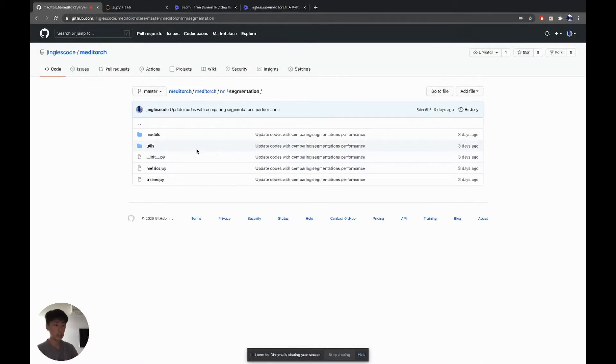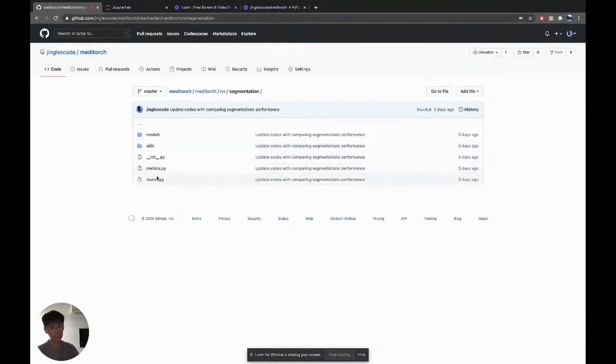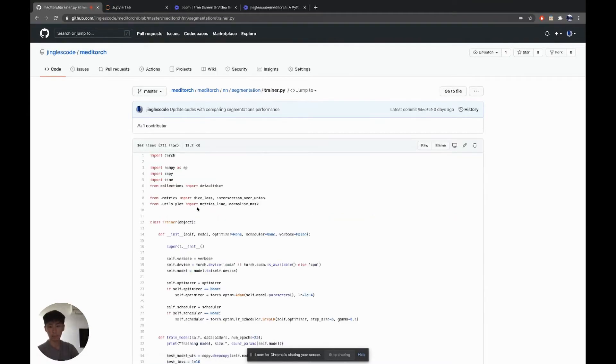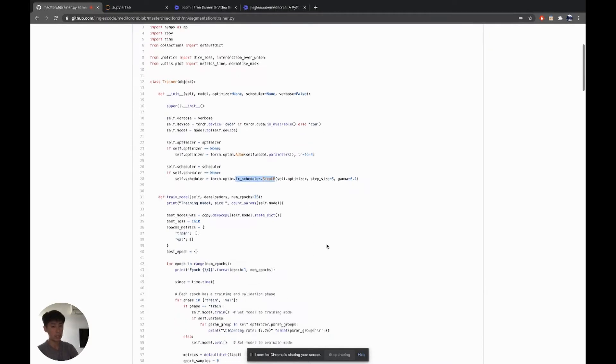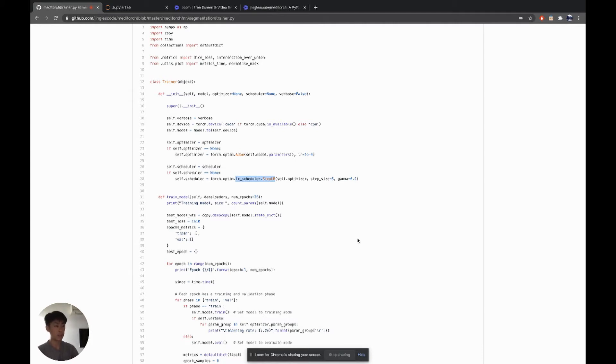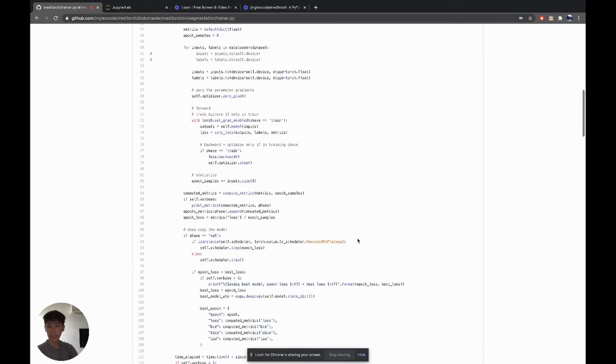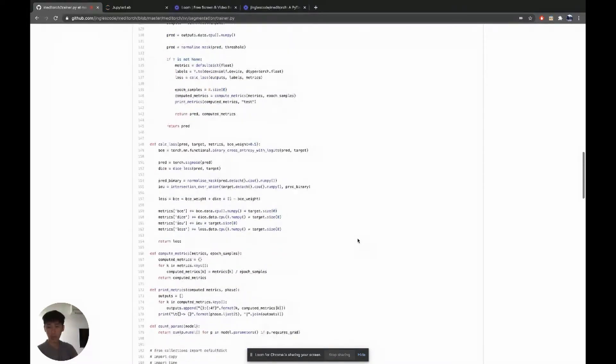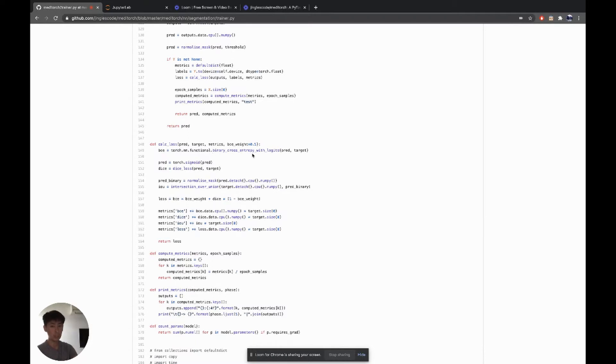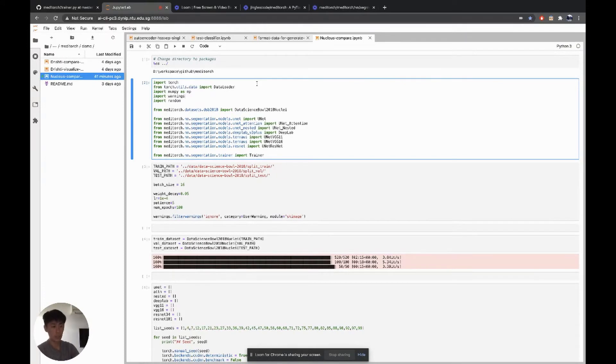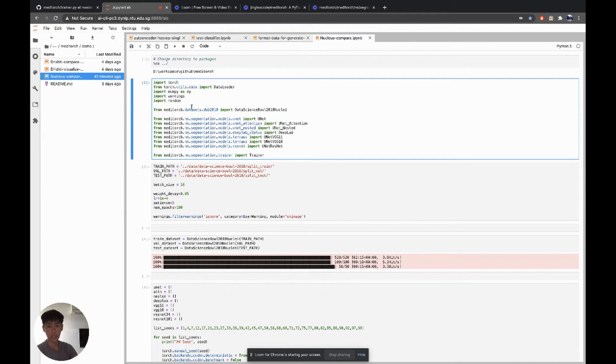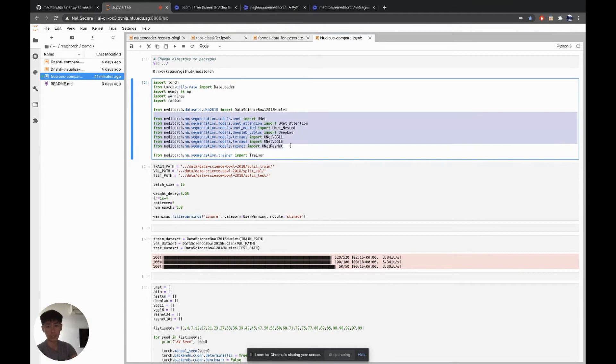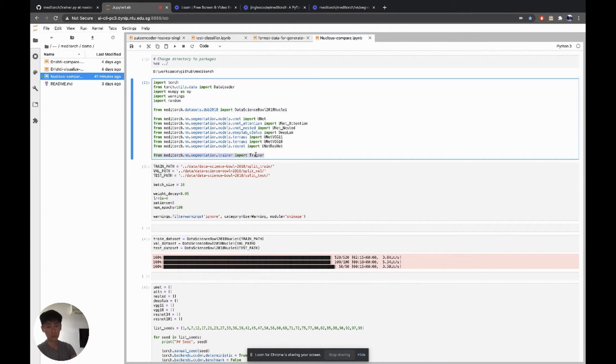Iterate over 100 iterations with a mini-batch of 16 because of a limit in GPU size. So 16 is our batch size. We use the Adam optimizer, which is over here. And then we use an LR scheduler step LR. When the loss did not improve, then we will reduce the learning rate by tenfold. And then we also added an L2 penalty to reduce overfitting. So it's over here. And then our loss function is this calculate loss, which basically uses both binary cross-entropy with DICE loss. So this is a combination of these two for our loss function.